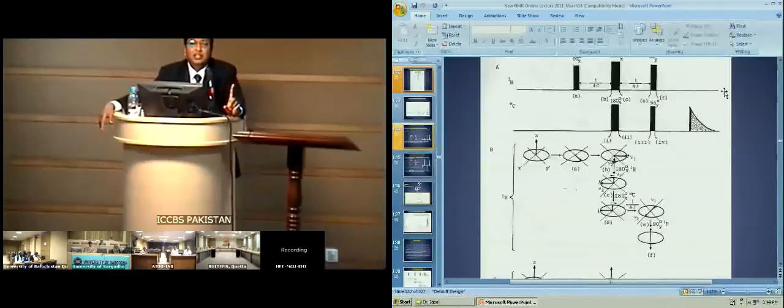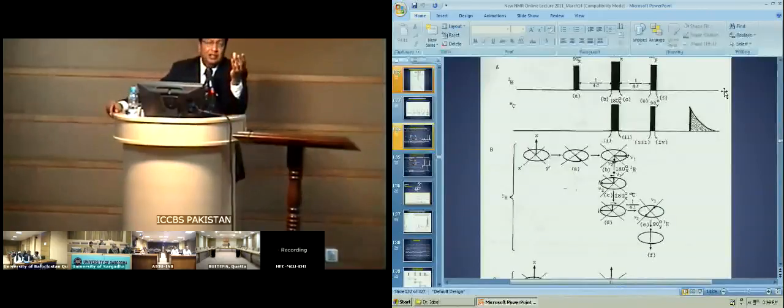Well, one thing I want to mention here is that the pulse sequences in NMR spectroscopy are now composite pulse sequences. Like in music, the symphony is now added. For instance, broadband, so-called spin echo. People don't say that.